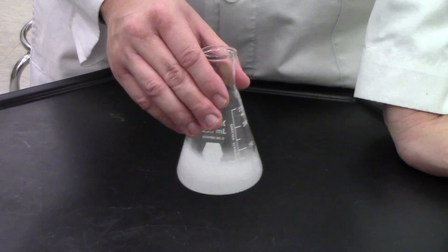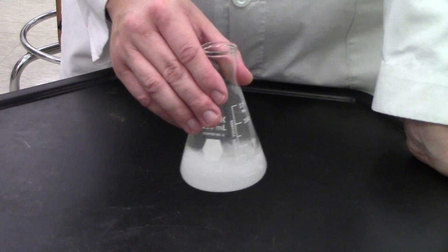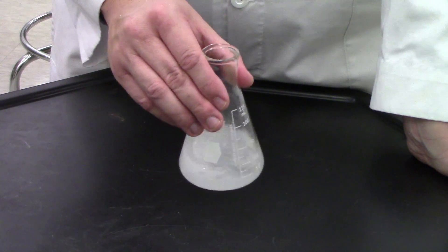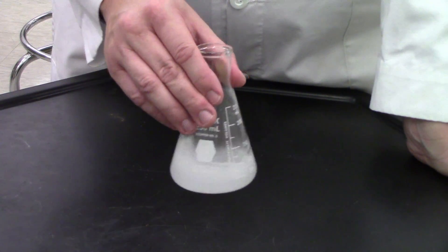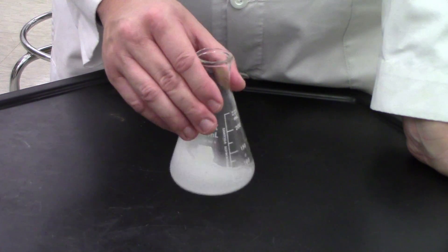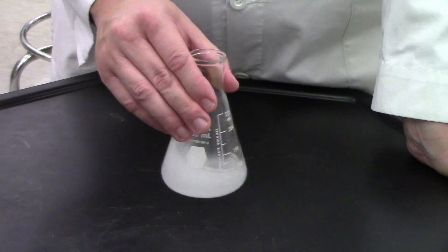When the bubbles finally stop, the reaction is complete and all of the baking soda will have reacted with the hydrochloric acid, leaving just sodium chloride and water in our solution. Any excess hydrochloric acid - because we've used more than needed to ensure all the baking soda reacted - and all of the carbon dioxide contained in the baking soda should have bubbled away. Sometimes this can take four or five minutes depending on the strength of the acid, but with ours it should only take about a minute or two.